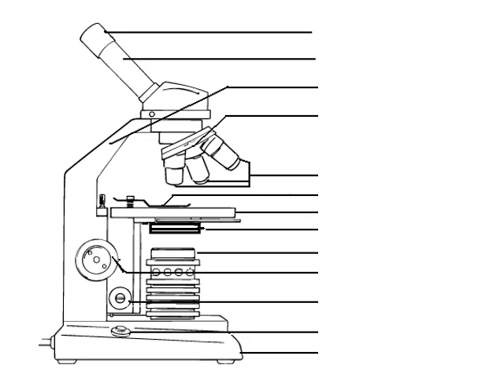And he looked at all sorts of stuff under the microscope. You name it, pond water. He looked at saliva. He looked at the plaque on his teeth. He looked at dirt from under his fingernails. He looked at earwax. He looked at dirt in the garden, anything. And he drew a whole pile of diagrams of what he saw under the microscope and called a lot of these things animalcules. So he was one of the first people to actually draw some of the bacteria and tiny protists that we see now. So we're just going to go through some of the parts.